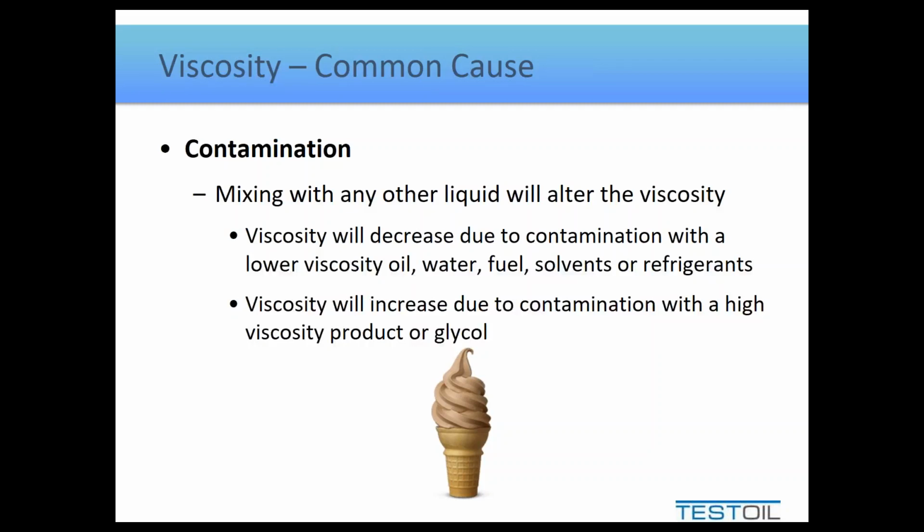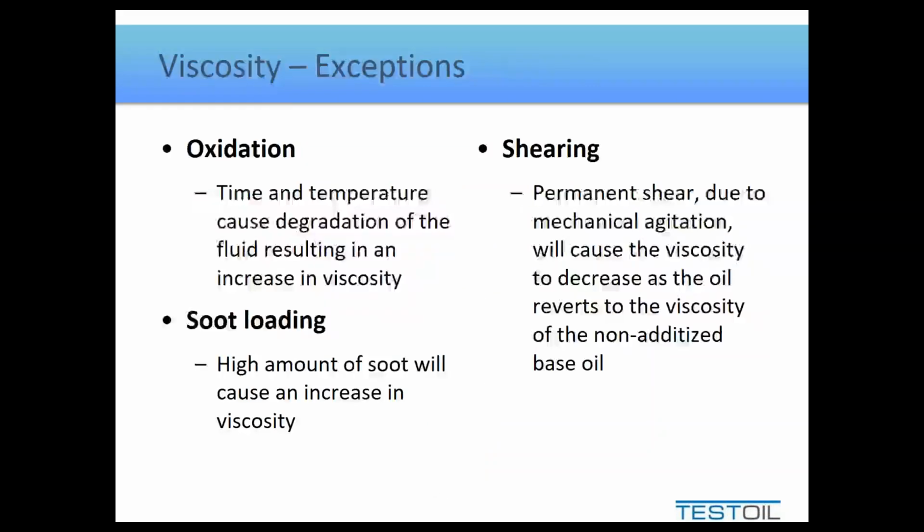It's even the right color. Glycol in oil forms emulsion very readily. So whenever we know that we have a coolant leak and the glycol is not being boiled off or driven out, you should expect to see an increase in the viscosity to correlate with that. Now, other things that will change the viscosity, short of mixing with something else, again, going back to oxidation.